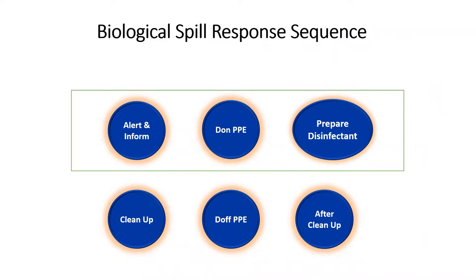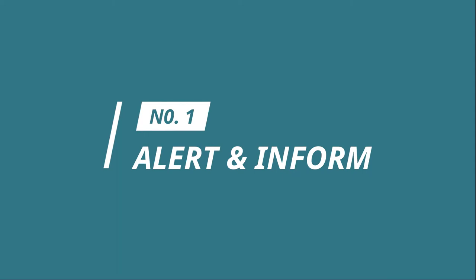There are six steps to a biological spill cleanup sequence. They are: alert and inform people around to evacuate, donning of PPE, preparing disinfectant, cleaning up procedure, doffing of PPE, and after cleanup procedure. It is important to note that the first 30 minutes of a biological spill is to wait for aerosol to settle.